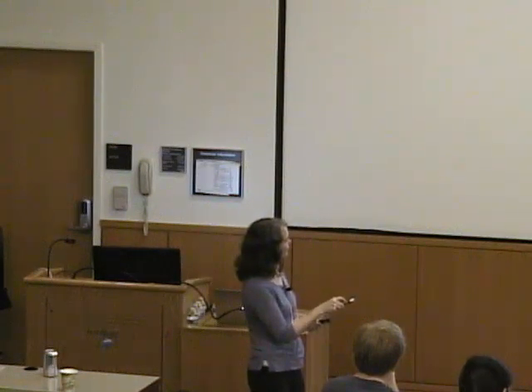All right, so look at this monster. It's 850 parts per million here, with a line width of 120,000 hertz. Remember, usually you're collecting a 10 ppm spectrum. So this is the one that will come and eat all of your other spectra. That's very cool. They were able to assign actually both of the protons, one at 800, one at 850, with these very large line widths.